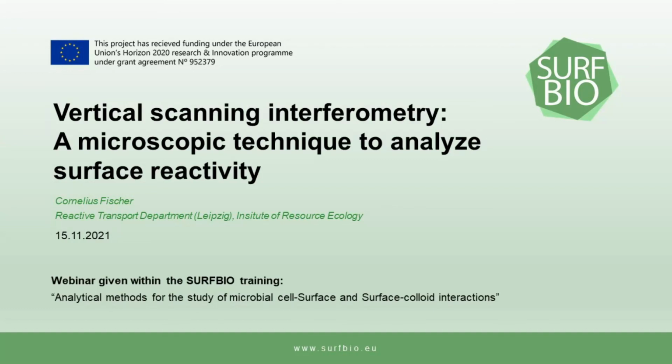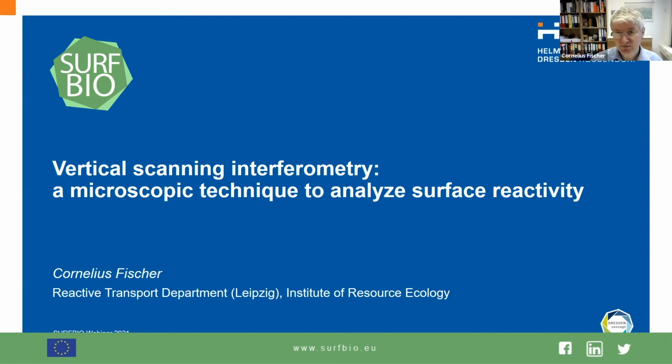Welcome again to this lecture about vertical scanning interferometry. So it's a microscopic technique, and one of the major purposes for us is to analyze surface reactivity.